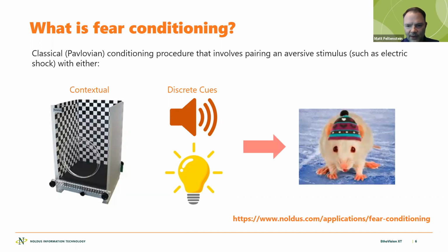So this is basically, again, the different phases. We're looking to see how much the animal is freezing. Of course, if you're interested in more information, you can always go to noldus.com/application/fear conditioning for additional information.